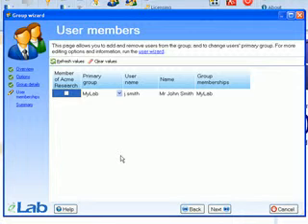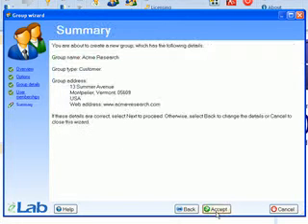As there are no records of individuals belonging to this group in the system, this screen can be skipped. However, if John Smith, for example, was also a member of this group, this could be specified at this stage. Confirm the details and complete the wizard.